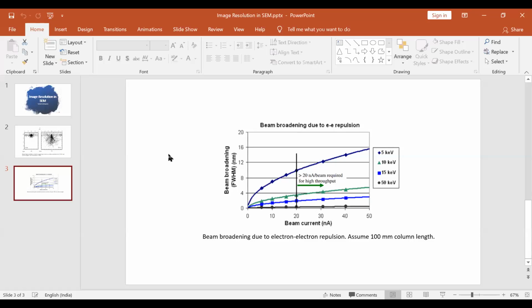So to wrap up, some researchers have theoretically studied beam broadening in thin films based on Monte Carlo techniques as well. For a typical sample thickness of 100 nanometers, the beam broadening for rutile is about 8.5 nanometers at 200 kilo electron volt incident beam energy. So in principle, the beam broadening is weaker for thinner samples. This is the conclusion that I've arrived at. Thank you.